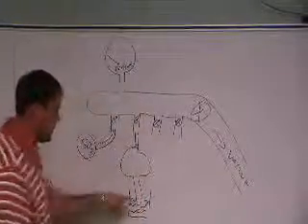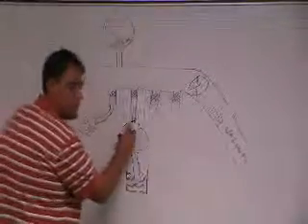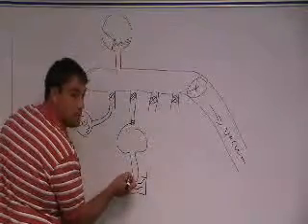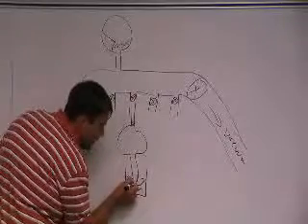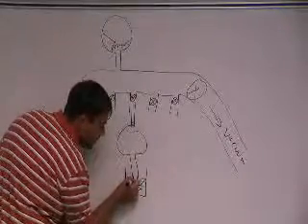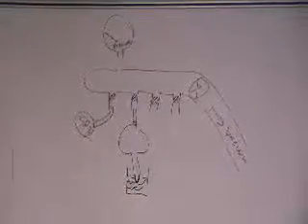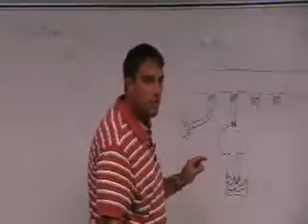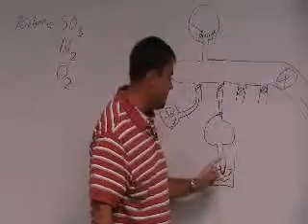and I'm going to put on that tip. And when I do that, what's going to happen to this gas right here? It's going to change to a solid. So basically I will have SO3 ice in the bottom of my flask. Does that make sense to you? So I've taken a gas, I've changed it to a solid using liquid nitrogen. It means I have made ice.